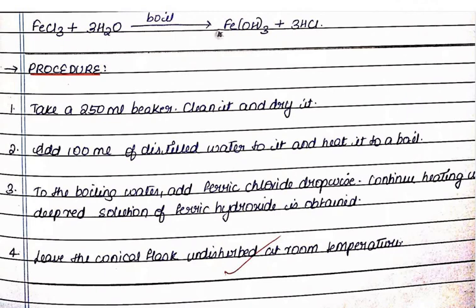What is the procedure for performing this experiment? First, take a 250 ml beaker, clean it and dry it. Add 100 ml of distilled water to it and heat it to a boil. To the boiling water, add ferric chloride drop wise. Continue heating to get a deep red solution. Ferric hydroxide sol is obtained.